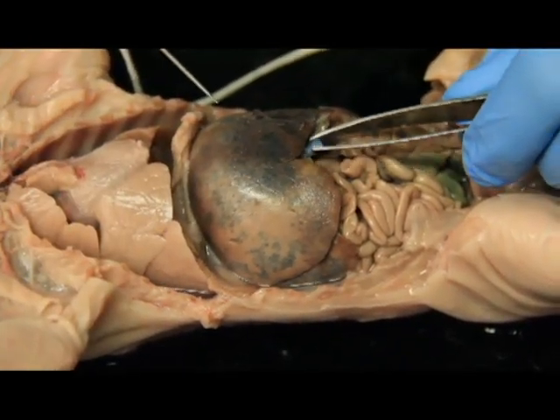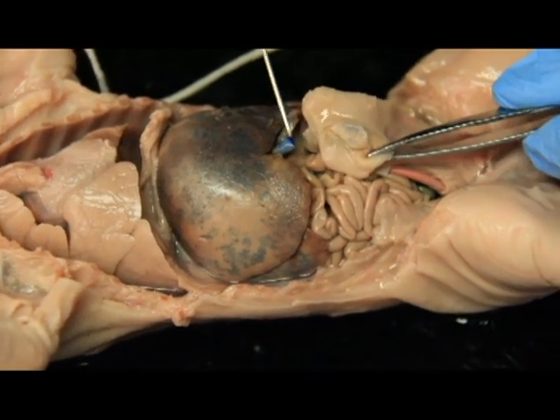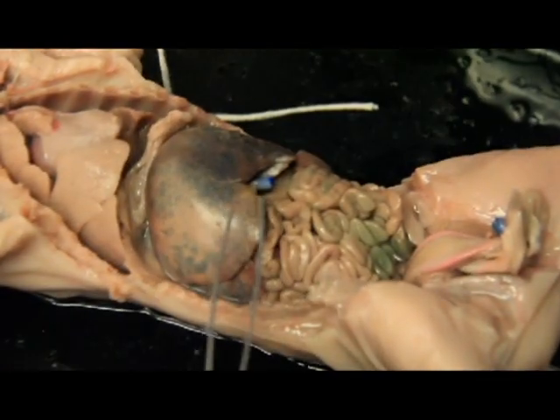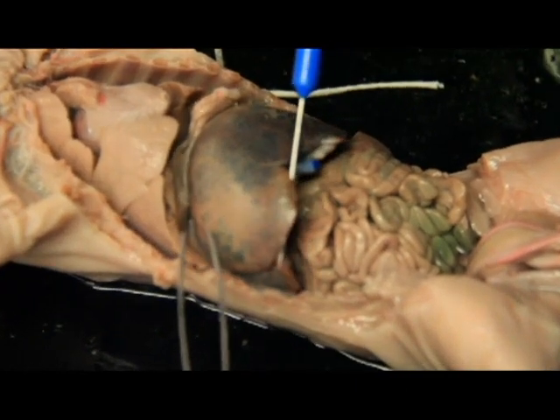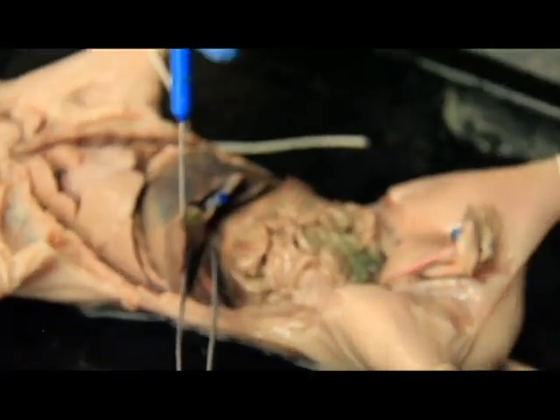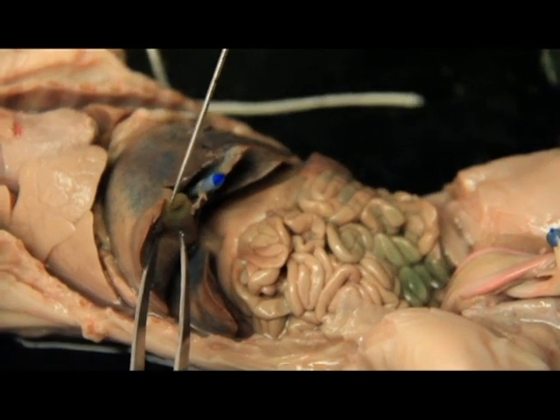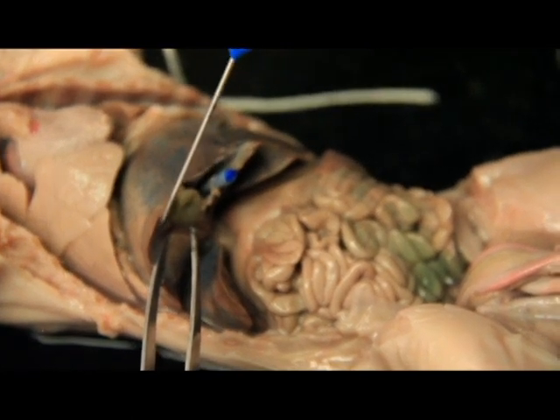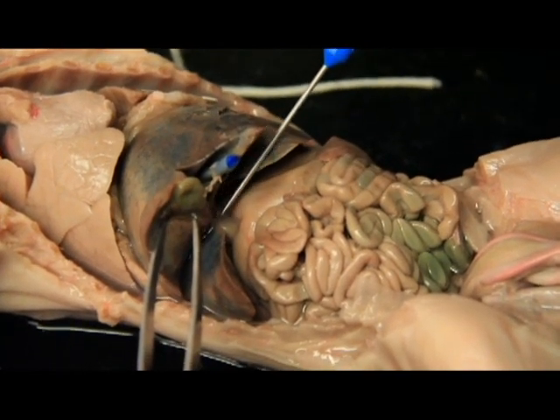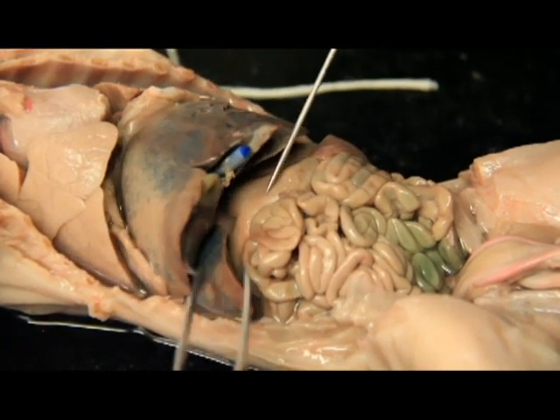This again is our umbilical vein that we cut, which was going towards our umbilical artery, or our umbilical cord right here. So we cut this and flapped it down. If we lift up the liver very gently, we want to use our tools and not our fingers so we don't damage anything, what you can see under the right hand side is this little deflated sac. This little deflated sac is our gallbladder. The liver produces the bile, and this gallbladder stores it. Then coming down from that, this little tube is our common bile duct. And that's to transport the bile from the gallbladder to the duodenum.